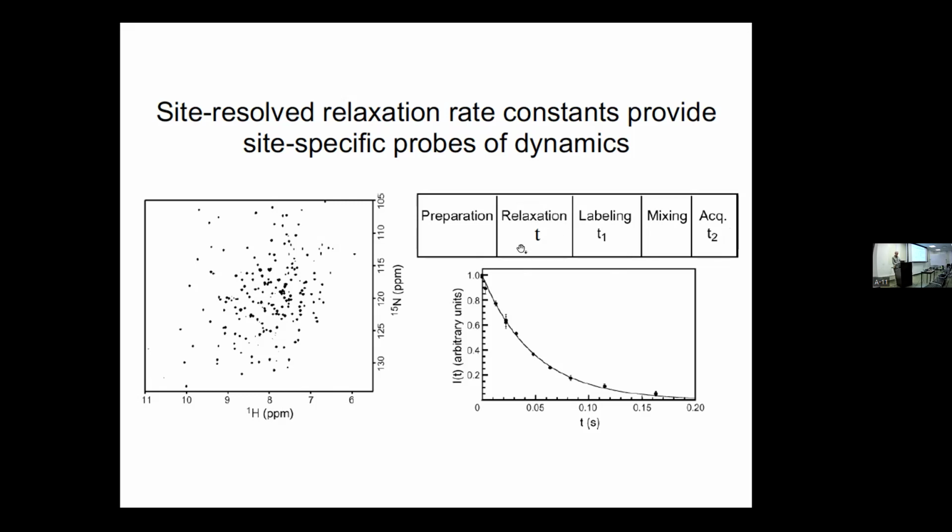And then the main issue is the preparation has to prepare the spin system in such a way that we can interpret the relaxation time dependence. So in particular, fitting multi-exponential decays whose time constants are similar is extremely difficult.